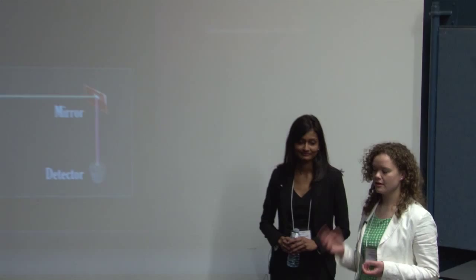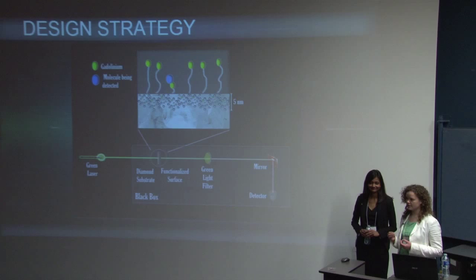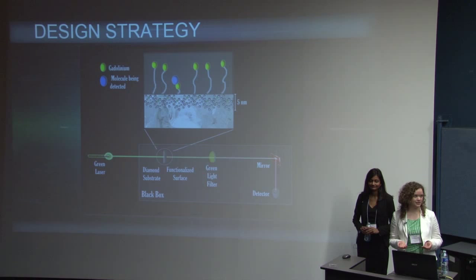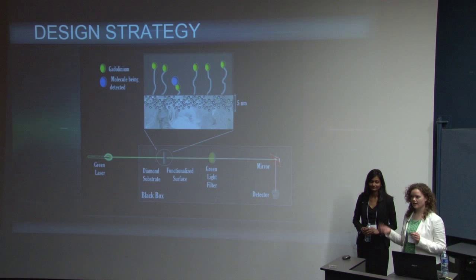And what happens is that the DNA aptamer has a structure switching ability, which allows us to bring magnetic particles close to our diamond surface. And when the magnetic particles are close to the surface, we will have a lower intensity of light that we can collect from our diamond surface. And when the particles are farther away, we'll have a higher intensity of light from the surface. So this is the phenomenon that we're trying to detect: the lower and higher intensity from our diamond surface caused by the presence or absence of magnetic particles.